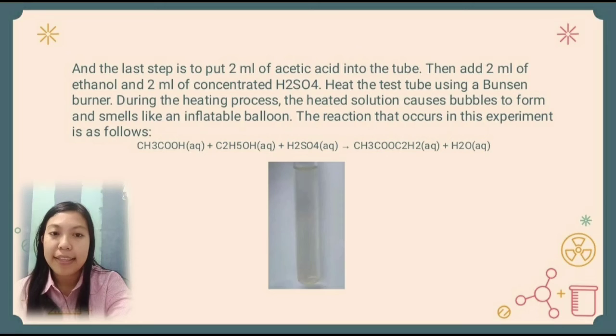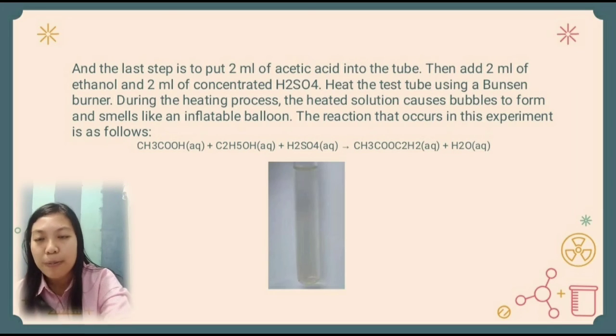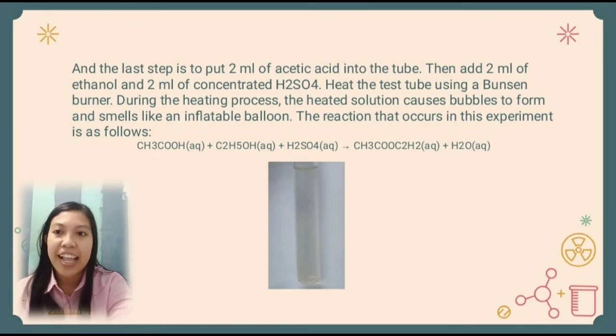Heat the test tube using a Bunsen burner.